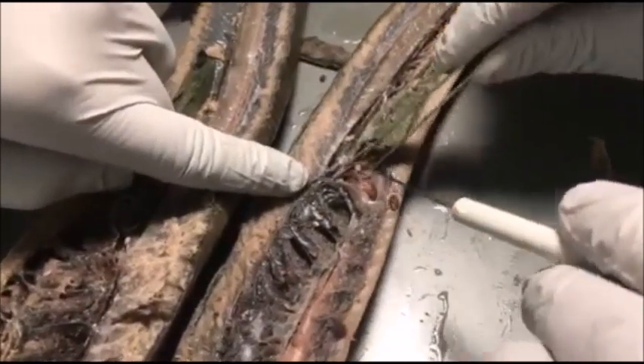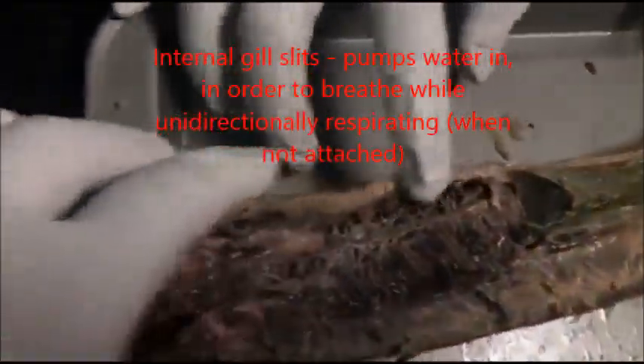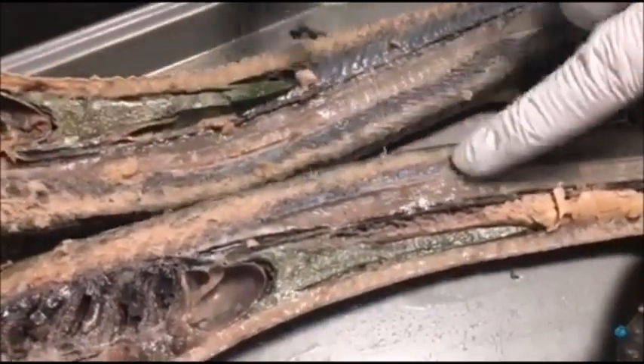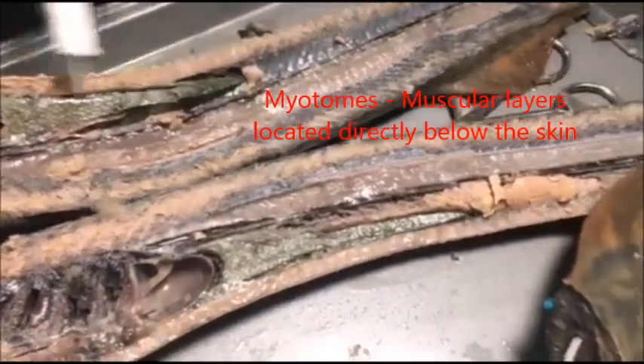Here we have the heart. The area in the middle contains the internal gill slits, which are connected to the outside so the lamprey can breathe. Here we have the myotomes, which are basically the muscles of the fish.